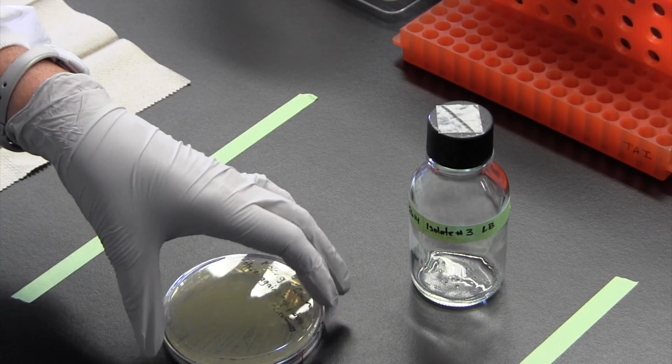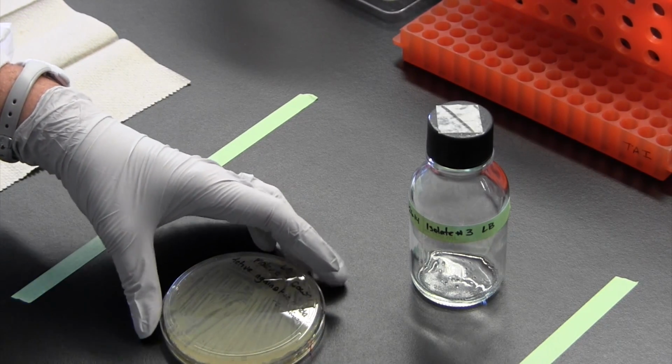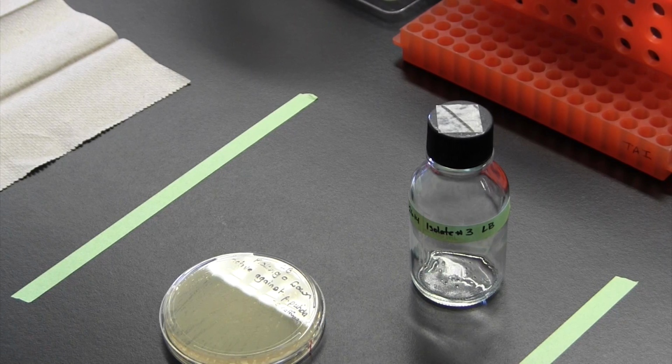We're going to model the ethyl acetate chemical extraction procedure that is written up in the manual. There are other options outside of this, but this method has been fairly well tested and fits within that time frame. If you use other solvents, it might take even longer than the 4 lab periods. So we're going to walk you through these steps. There are always some modifications, but hopefully this will clarify what to expect.